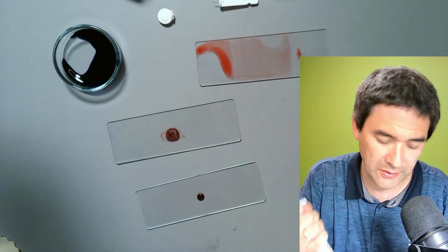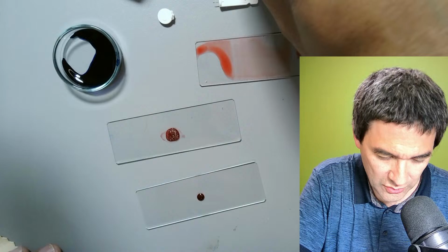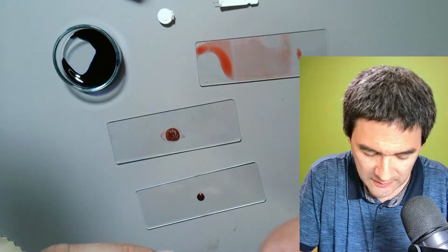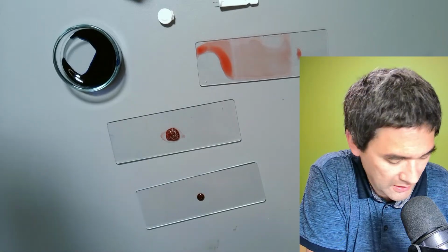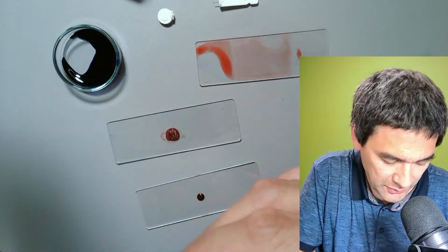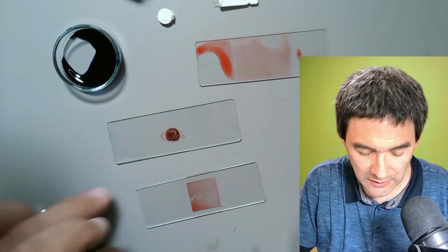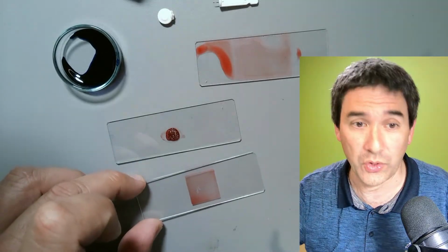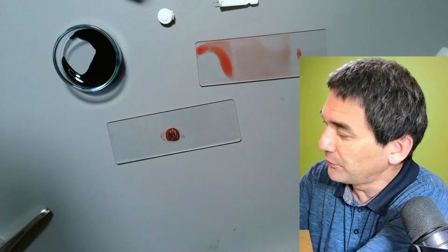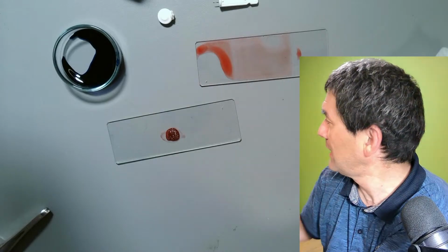So a small drop here. I'm going to use a cover glass again. There are two of them, okay. Let's put it on here. And again, I don't know how well this actually works, okay? This is the first time, really, that I'm trying a regular fountain pen ink to stain blood.